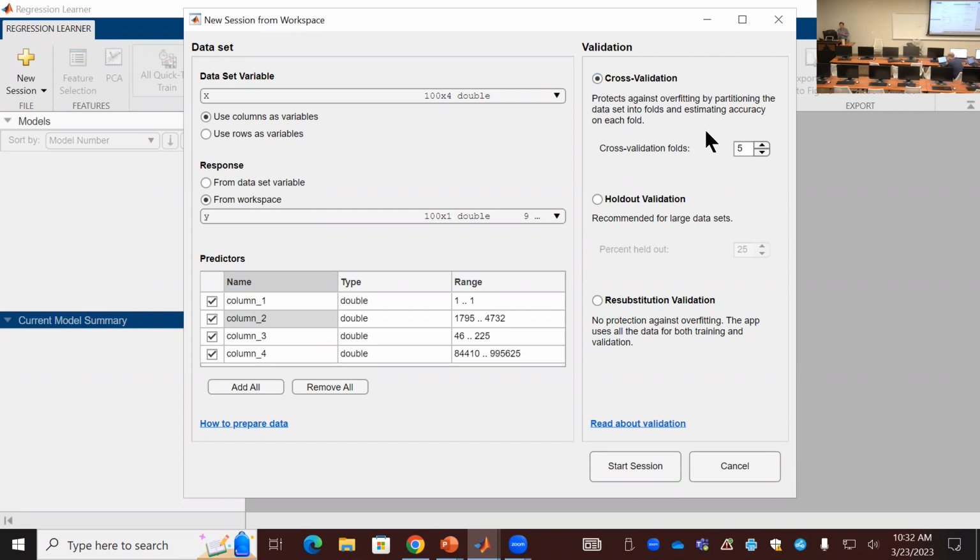What this will do is maybe cut the data into half, use the top 50 samples to predict, and then use the other half of the data to validate. So, okay, the slope you found works fine with the top 50 random samples, but not the rest. Something like that.